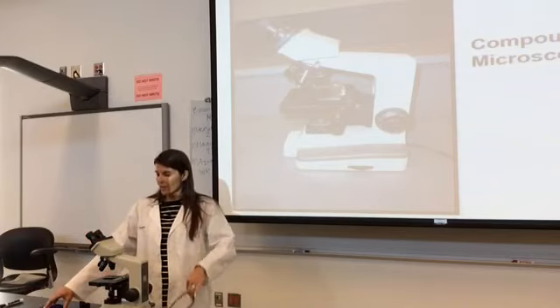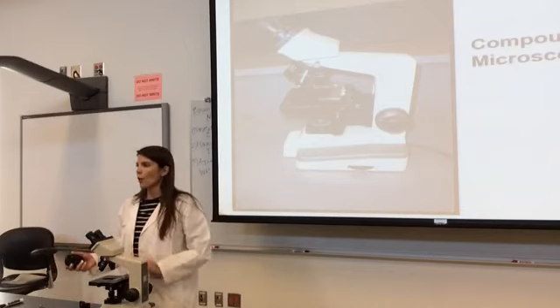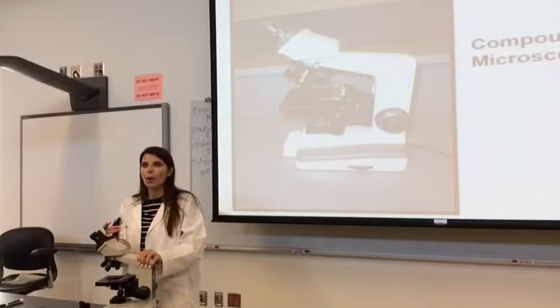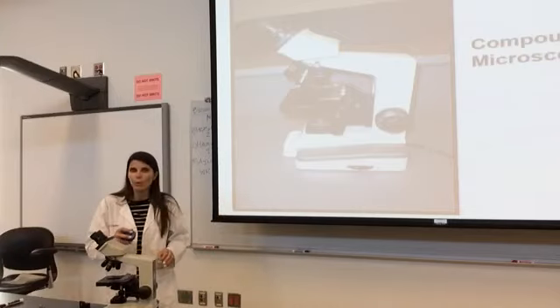So once you have your compound light microscope, it is considered a light microscope because it uses a light for its source, compound because of the number of lenses that it uses in order to focus on your specimen.